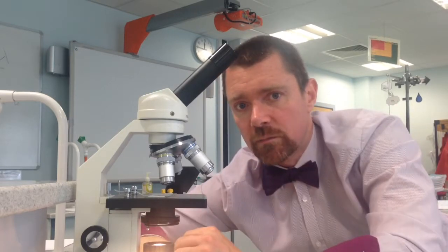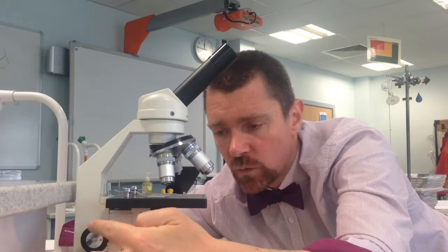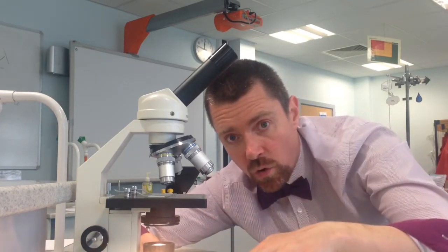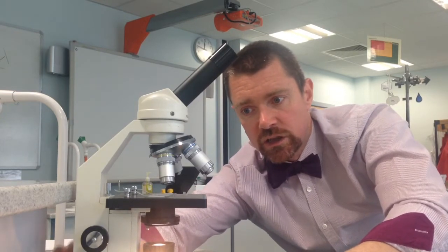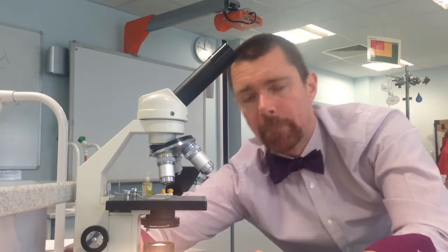Now the hardest thing is to find the sample under the microscope. So now you get two top tips. Tip number one: we use the focusing wheel to make sure that the stage is as low down as possible. If I turn the focusing wheel, you can see it moves the stage up and down, but we want it at the bottom — as low as you can get it. That's top tip number one.